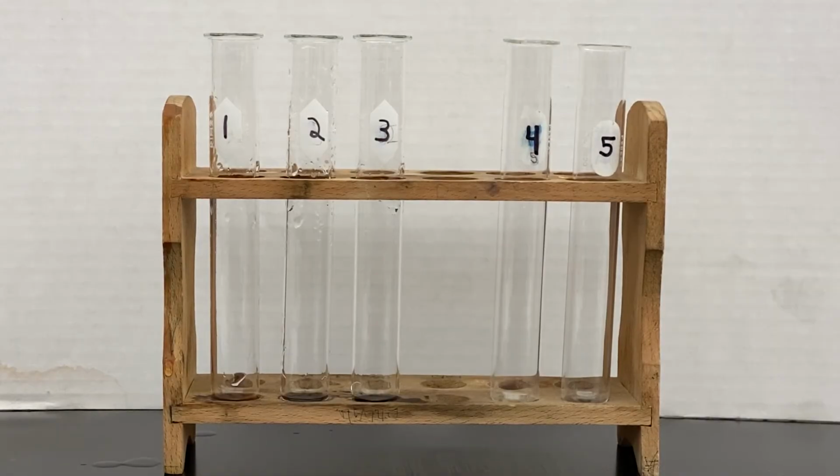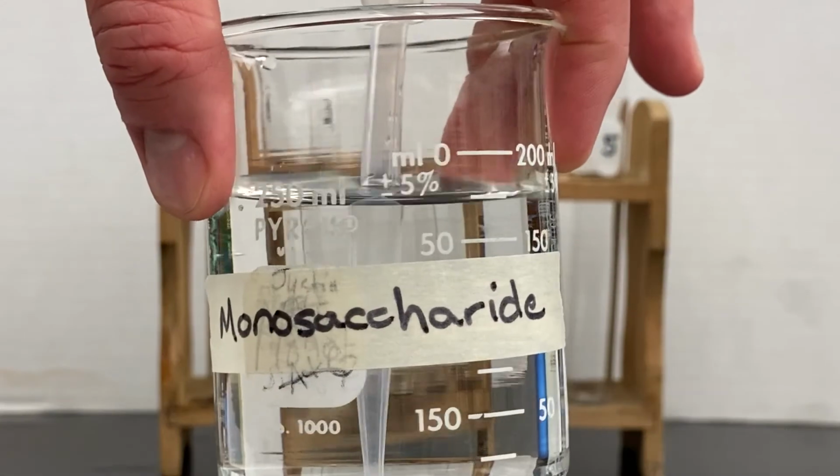Now that I have 3 clean test tubes, I'm going to do the same thing and put 30 drops of monosaccharide, of disaccharide, and of polysaccharide into each of these 3 test tubes. So here is my monosaccharide solution.